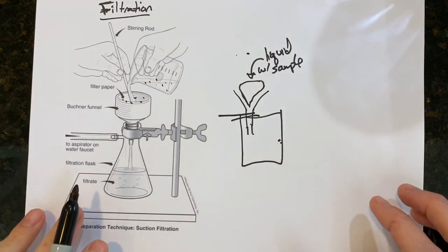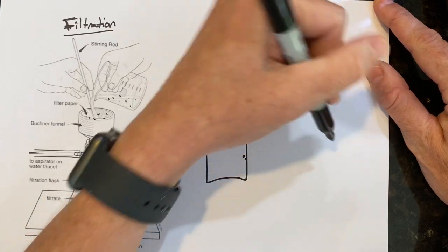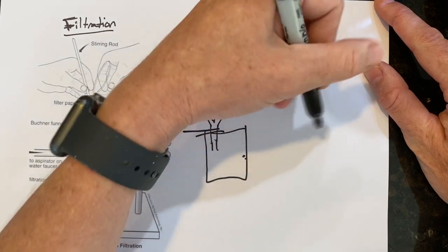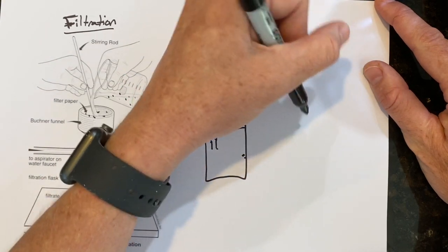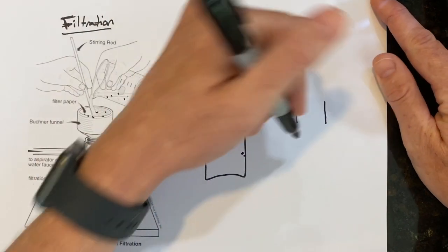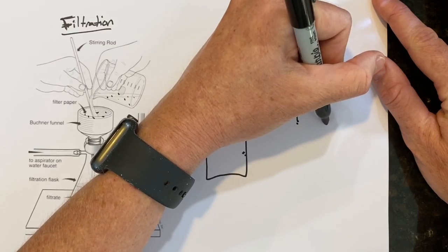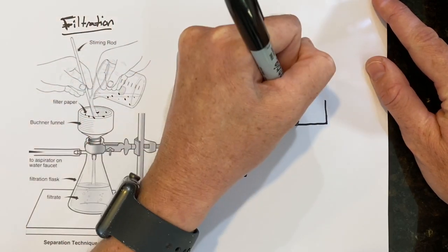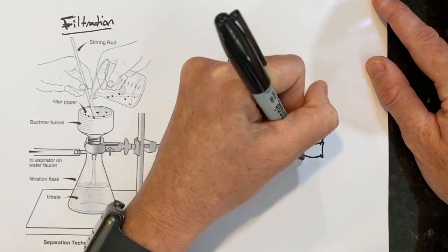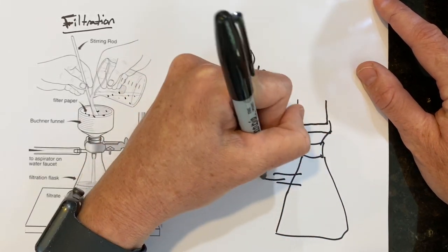Probably the most utilized analytical technique is neither of these. It's the following. It's using a crucible, and it will help walk us into the next section. A crucible is generally made out of porcelain or ceramic, and it looks like this. There's usually a connector that will connect it to the funnel itself, and you can have a stem on here going to the vacuum.